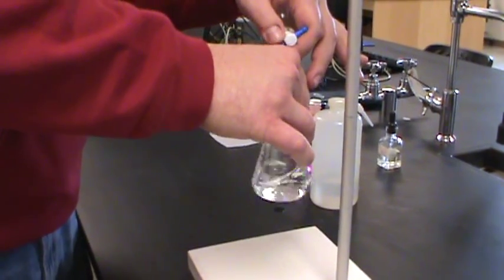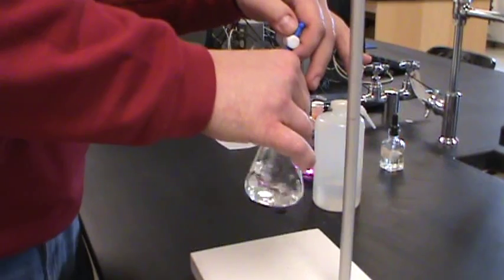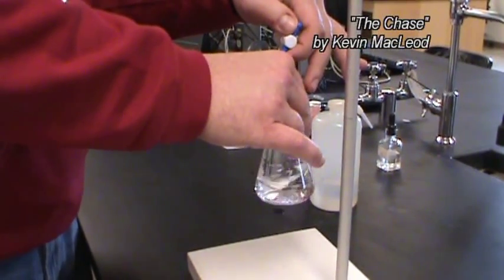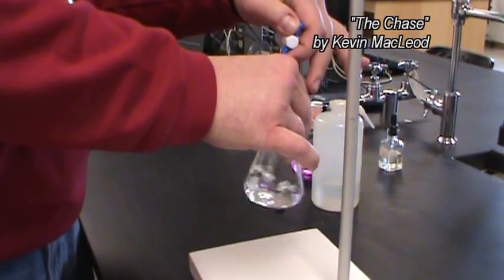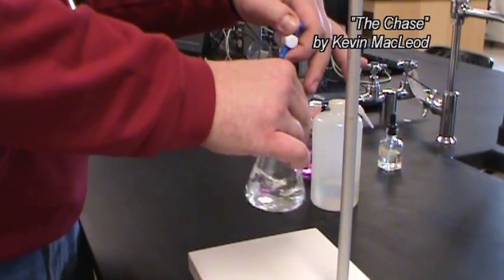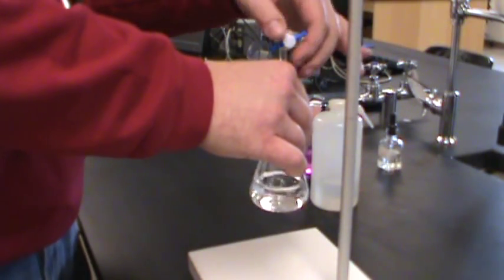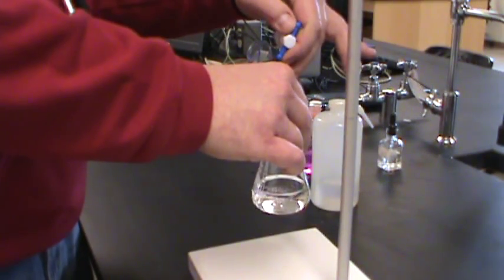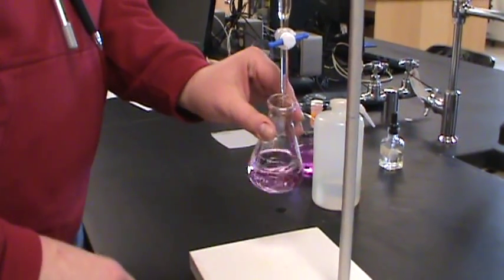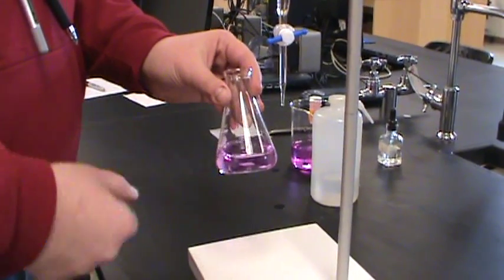Now it's taking a little bit longer for it to go away. So I'm going to slow down. Try adding a drop at a time, giving it a good swirl. I just stopped it. Everything turned pink, persistent endpoint. Tap that last drop off the side of the burette tip, and I'm at my endpoint.